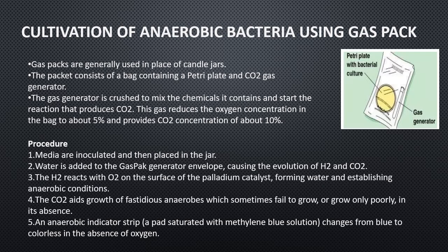The CO2 aids the growth of fastidious anaerobes which sometimes fail to grow. Now, the higher concentration of CO2 generated by the gas pack will aid the growth of fastidious anaerobes, okay, strict anaerobes, which sometimes fail to grow or grow poorly in its absence. So this high CO2 concentration will help the growth of anaerobes.